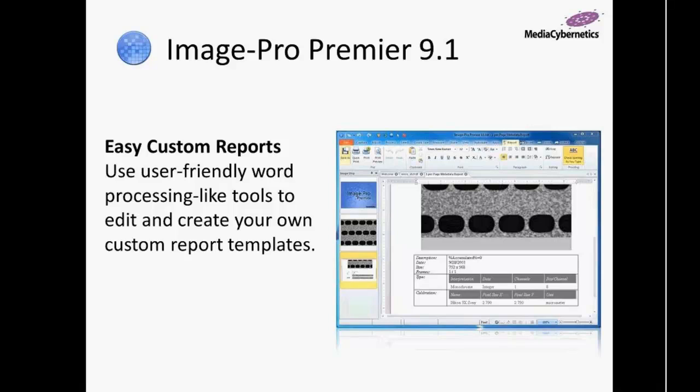And what's great about this is you can create a template. And once you've created that template with your logo and all the tables set up the way you like them, you can share that and you can also use it time and time again. And just by simply going to the Edit Report button, you'll be able to make small customizations to that and have a couple different iterations of it.